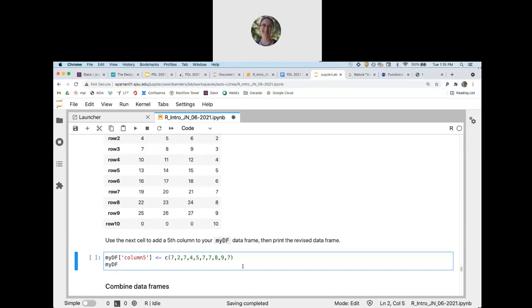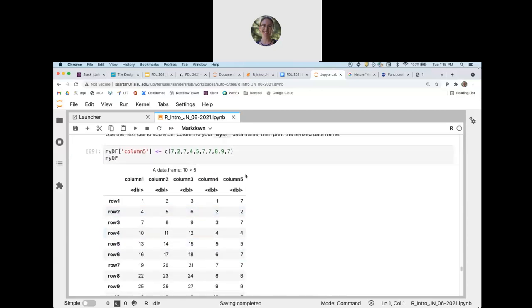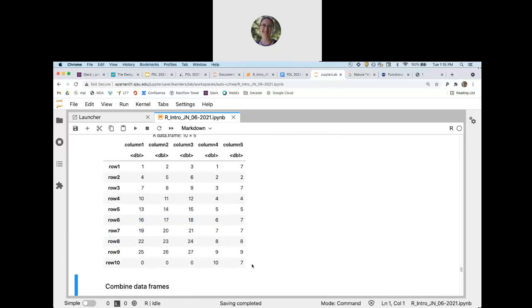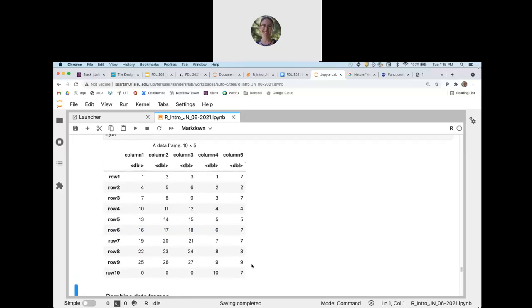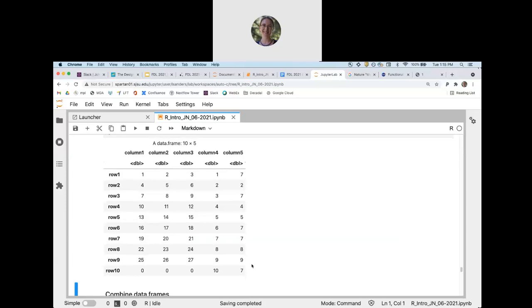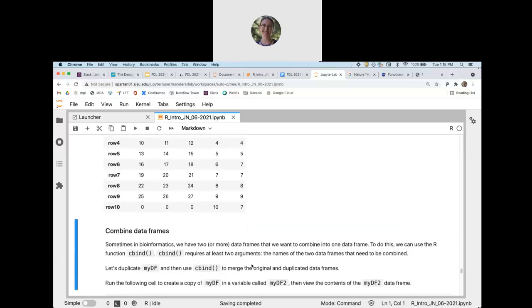Very good. All right, and when you print out your new data frame, hopefully you see your 5th column there. Let me know if for some reason you're getting an error and we can troubleshoot. Yeah, big numbers. The maximum of your data frame has now increased by orders of magnitude if you were to do summary.